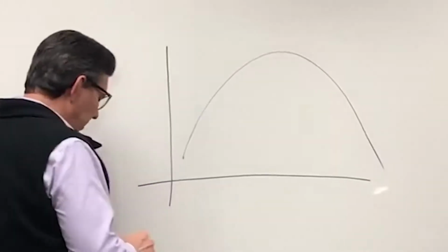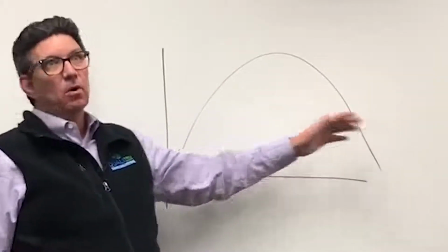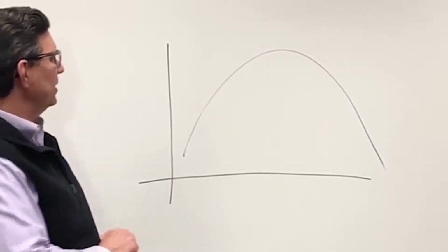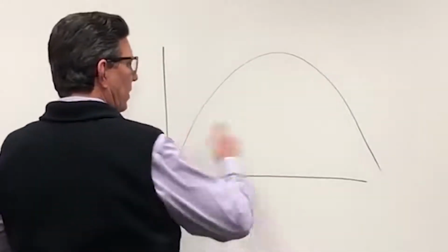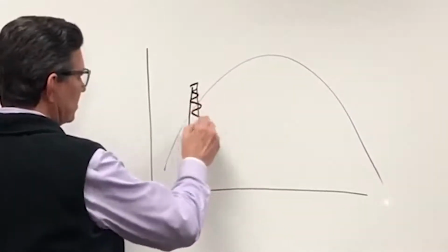So let's say I have a curve of some sort or another like that. And this might be representative of the milk flow through the line or something within our process. So if I come in here with a syringe, a 2-inch syringe, and I've got milk flowing through my line, and I take a sample with the syringe, I get this.